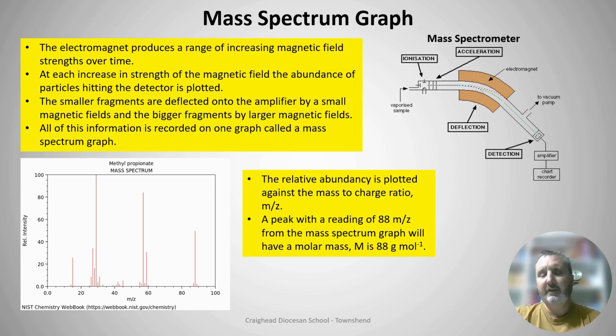Now this graph is really useful because when we know the size of the different particles that make up a molecule, we can put them back together like a puzzle to work out what the original molecule was.